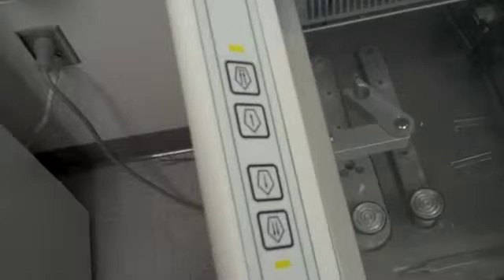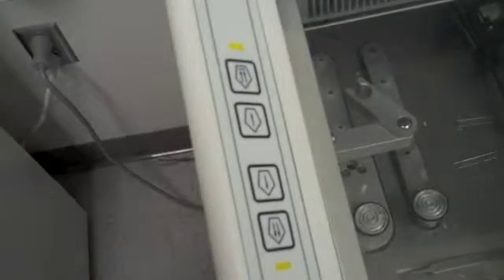The side panel has 4 buttons. These allow you to move the block you are slicing back and forth. The double arrows move the block continuously. The single arrows move the block only while depressed.